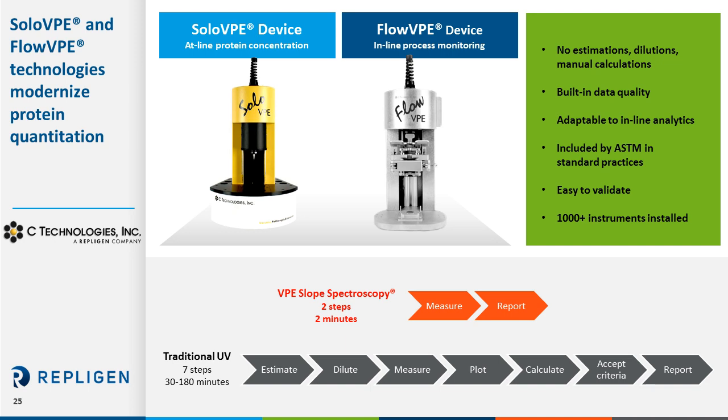It's certainly much easier to validate. It's being supported by ASTM now as well. And certainly the time and having a more robust method in place for all of your processing needs is certainly a more futuristic and, frankly, modern approach to how this is done.